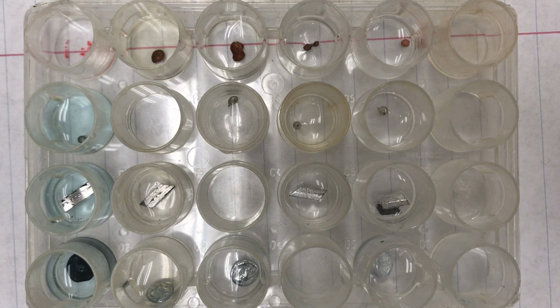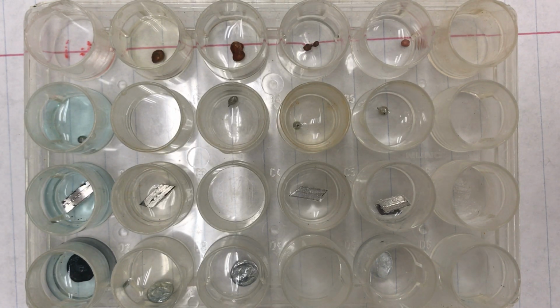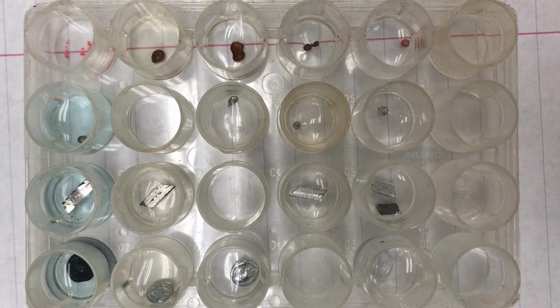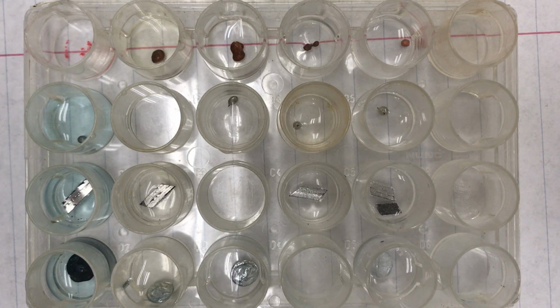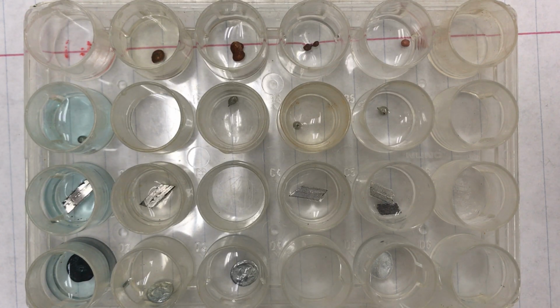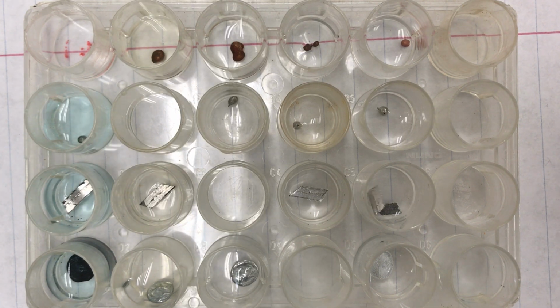All right, so your data table matches up with the well plate here. As you notice changes in the spot on the data table that matches up with the spot on the well plate, you should be starting to write in your observations.